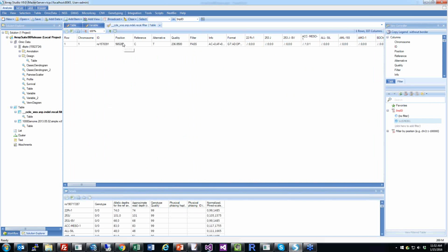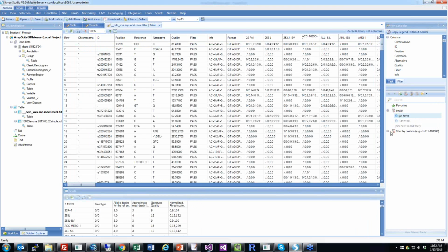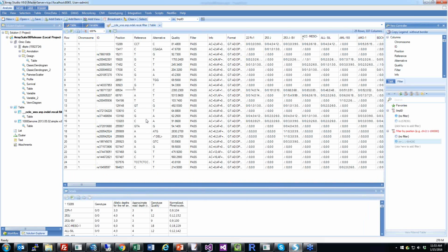filter to a given row, and this filter can be based on SNP ID, like I just tried the RSID, or I can try a region. And then you will be able to subset this VCF file for you. Now you can easily export this based on the region of interest. So it's kind of like TBI indexing, but doing this from the graphical user interface. But also TBI won't allow you to search for RSID or ID itself. Now we actually will be able to search for RSID.